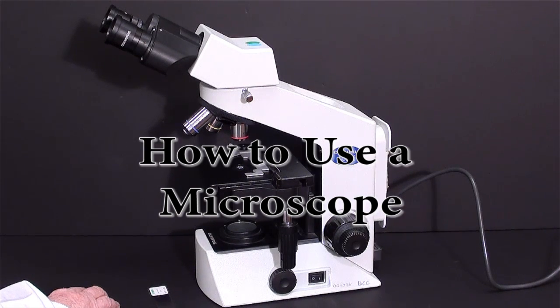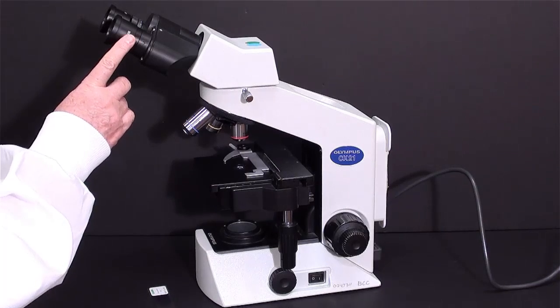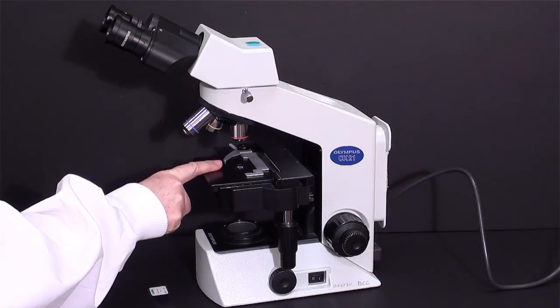Let's take a look at the major parts of a light microscope. These are the ocular lenses. These are the objective lenses. This is the stage.